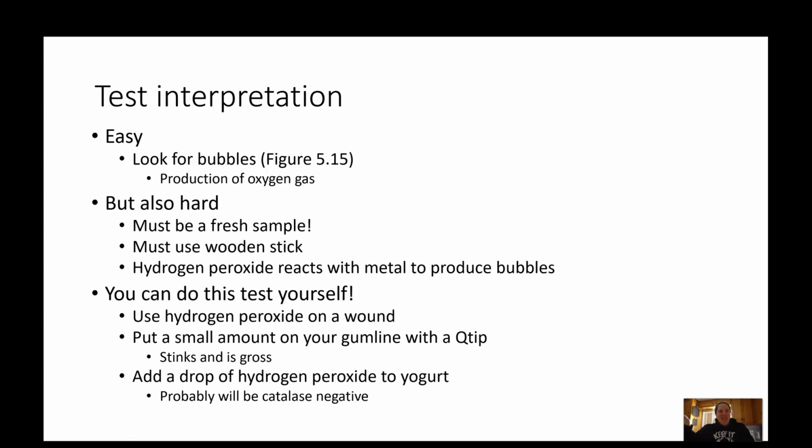And remember that hydrogen peroxide is toxic, so you don't want to swallow it. If you do this, just swish your mouth out with water and then spit it out in the sink after. I think there are some dentists' formulations of hydrogen peroxide at a lower concentration that you can use as a mouthwash, and of course, they recommend that you spit it out and don't swallow it.